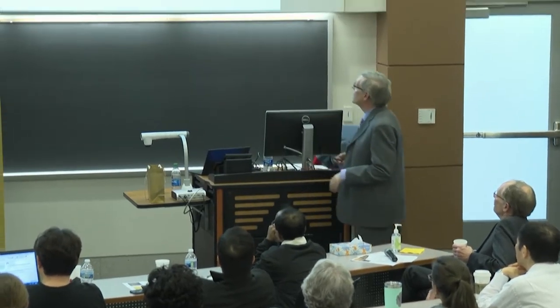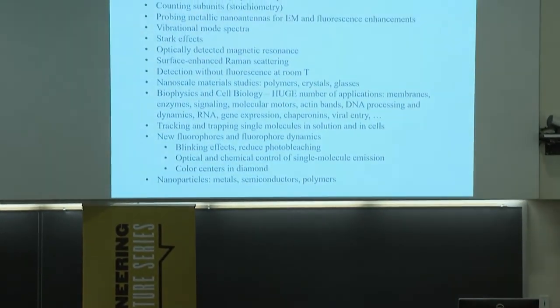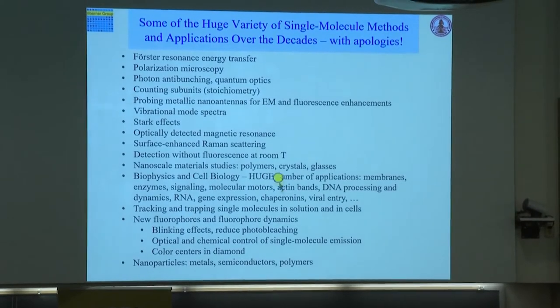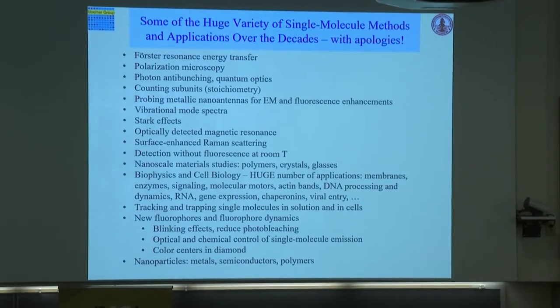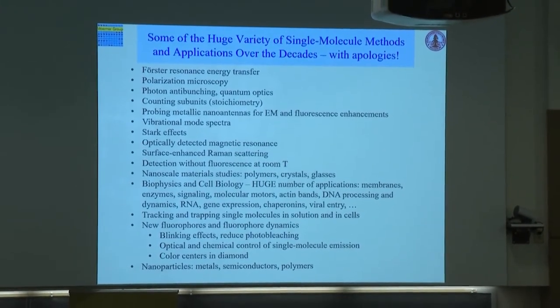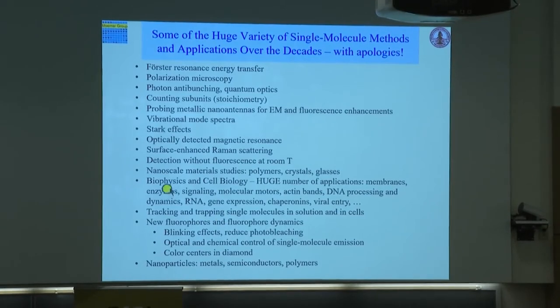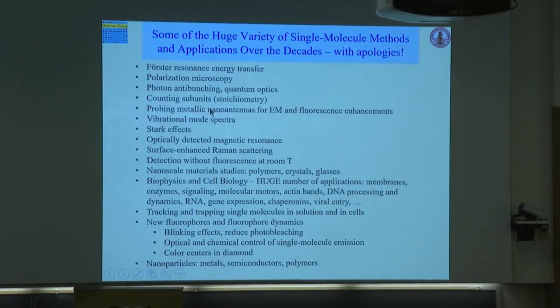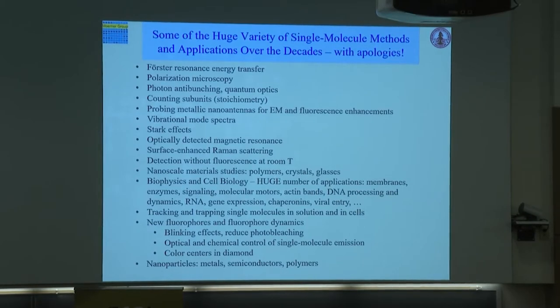And of course, there certainly is, and I apologize for this laundry list, but it's just to emphasize that so many interesting things have been done at room temperature and at low temperatures to just look at individual molecules. It's fantastic. There's applications to biophysics and cell biology. There's applications to photon antibunching, and so on. So it's wonderful to be able to look at these ultimate individual objects and ask questions about a complex environment, whether it's a polymer or a cell or other interesting situations.